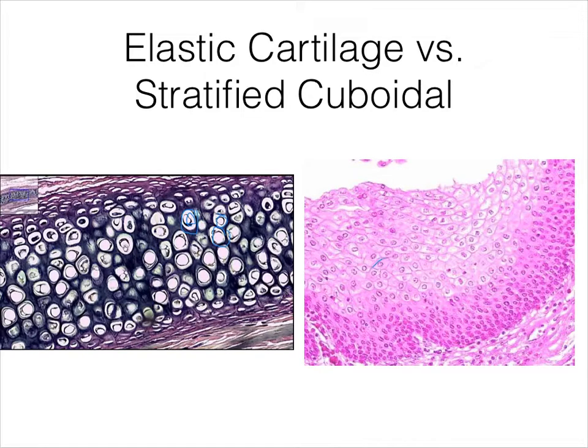In the epithelial tissue, you will see the cells do usually have a nucleus inside of a cellular area, but it looks very different from this sort of very clear lacuna and chondrocyte motif. If nothing else, in the stratified cuboidal epithelium, the cytoplasm of the cells usually stains light pinkish, whereas the lacuna outside of the cellular area in cartilaginous tissue is usually staining clear.